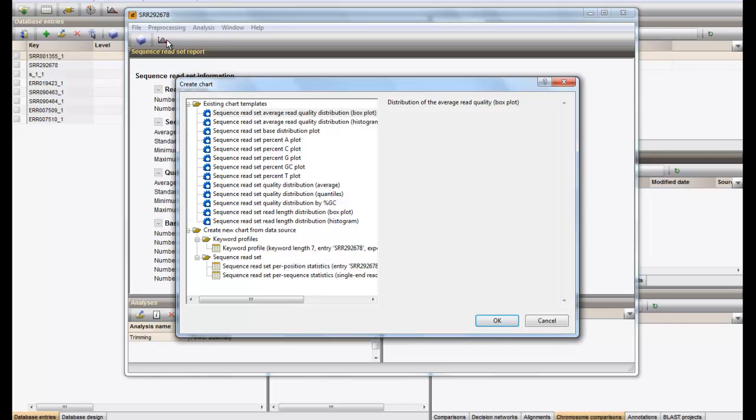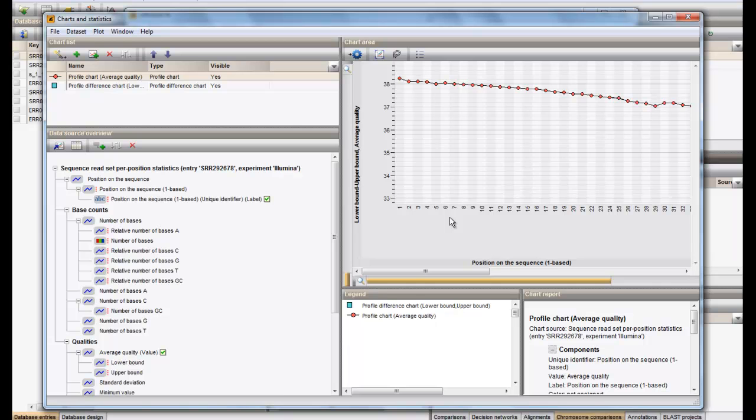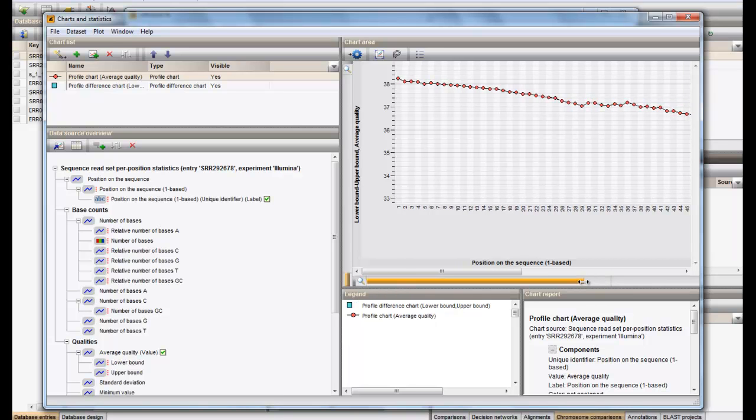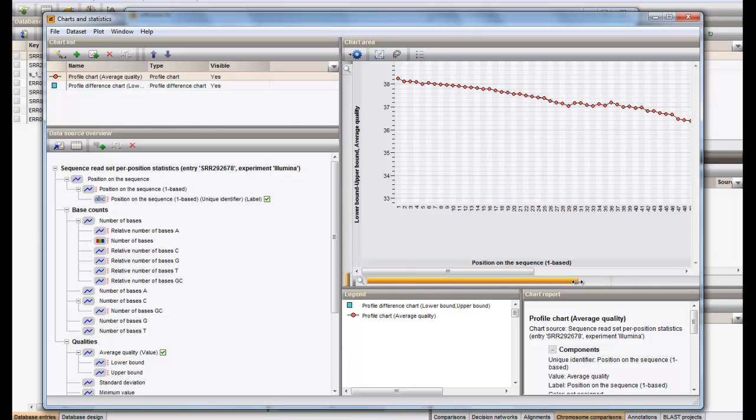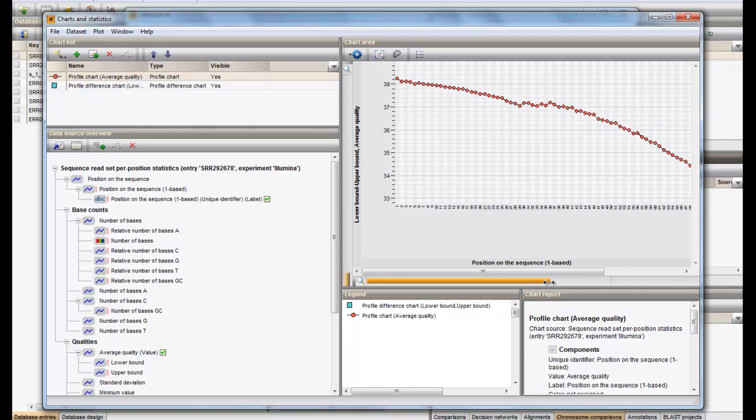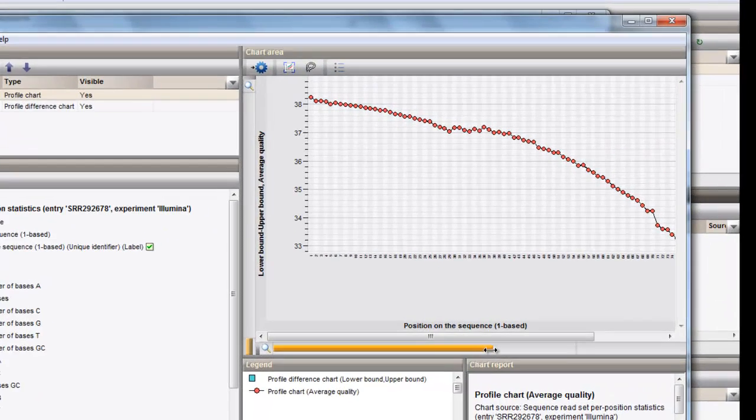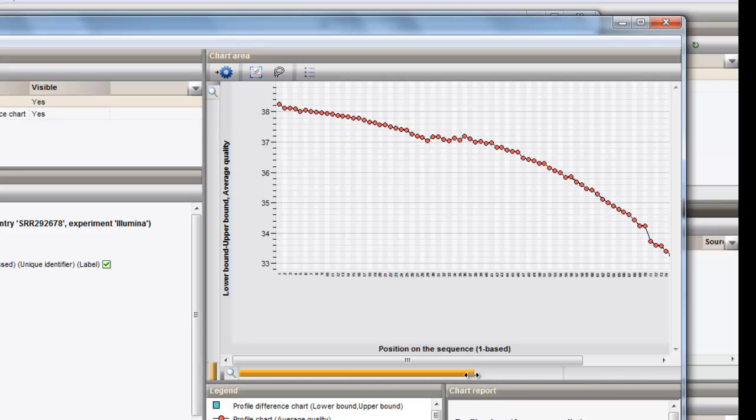As a third chart, we can have a look at the average quality distribution. One can clearly see a decline in average base quality from a quality score of 38 to 33 along the reads.